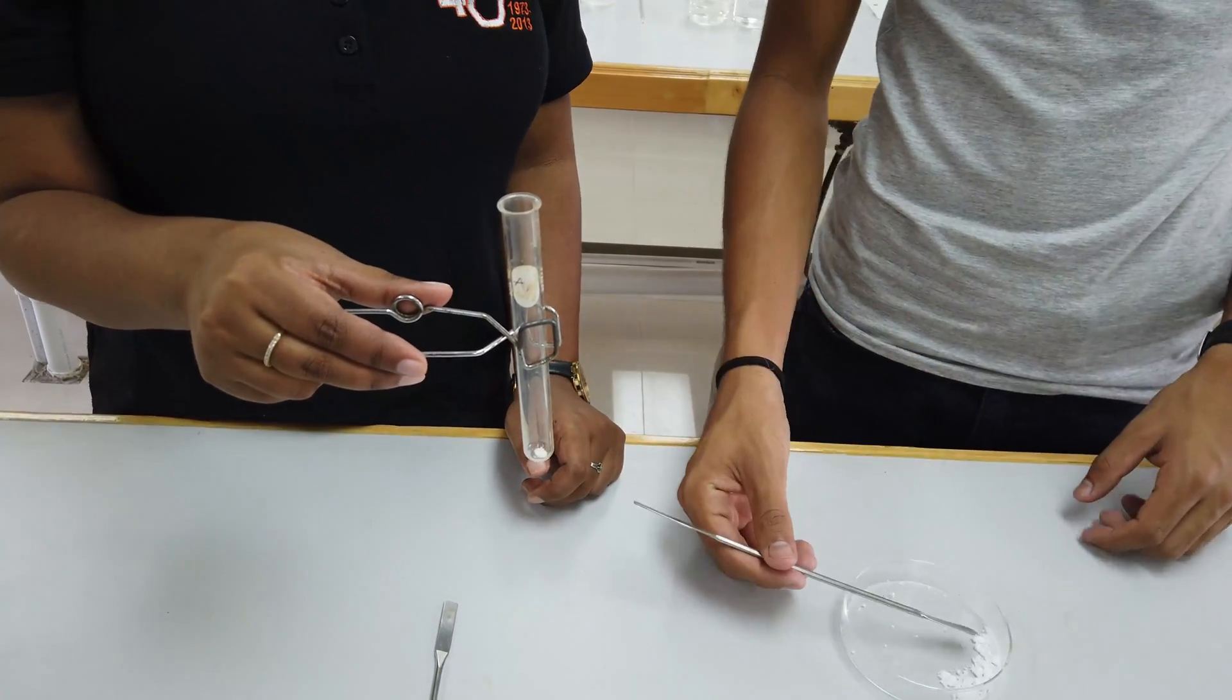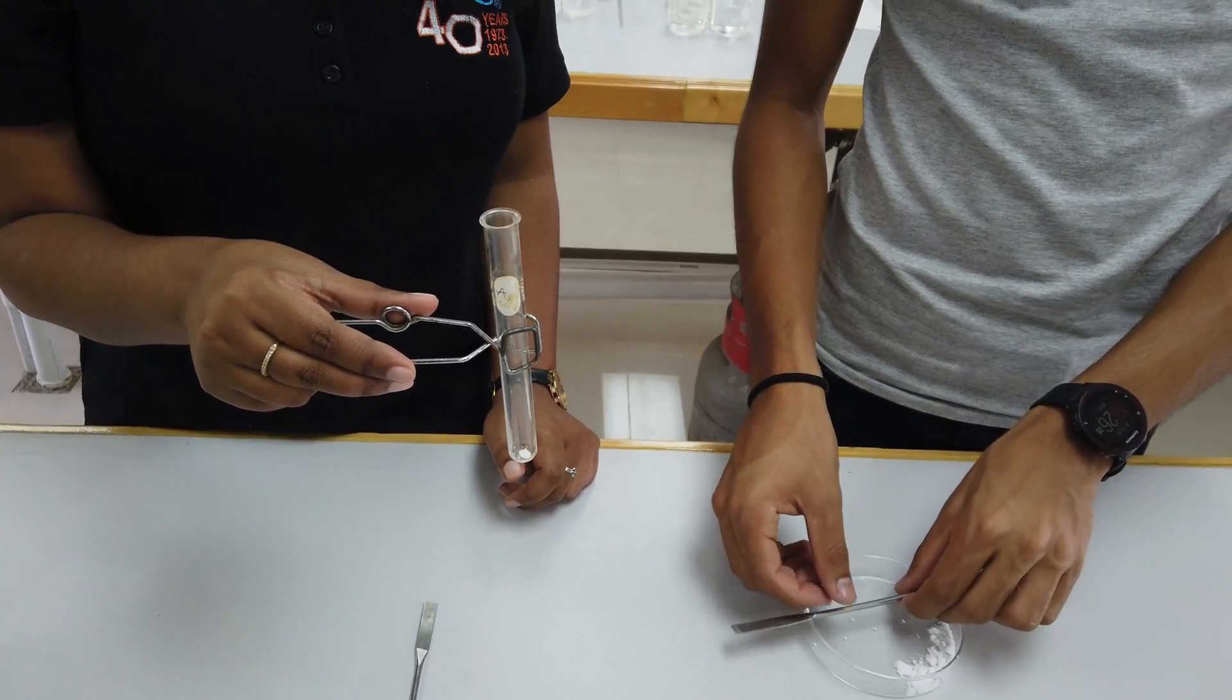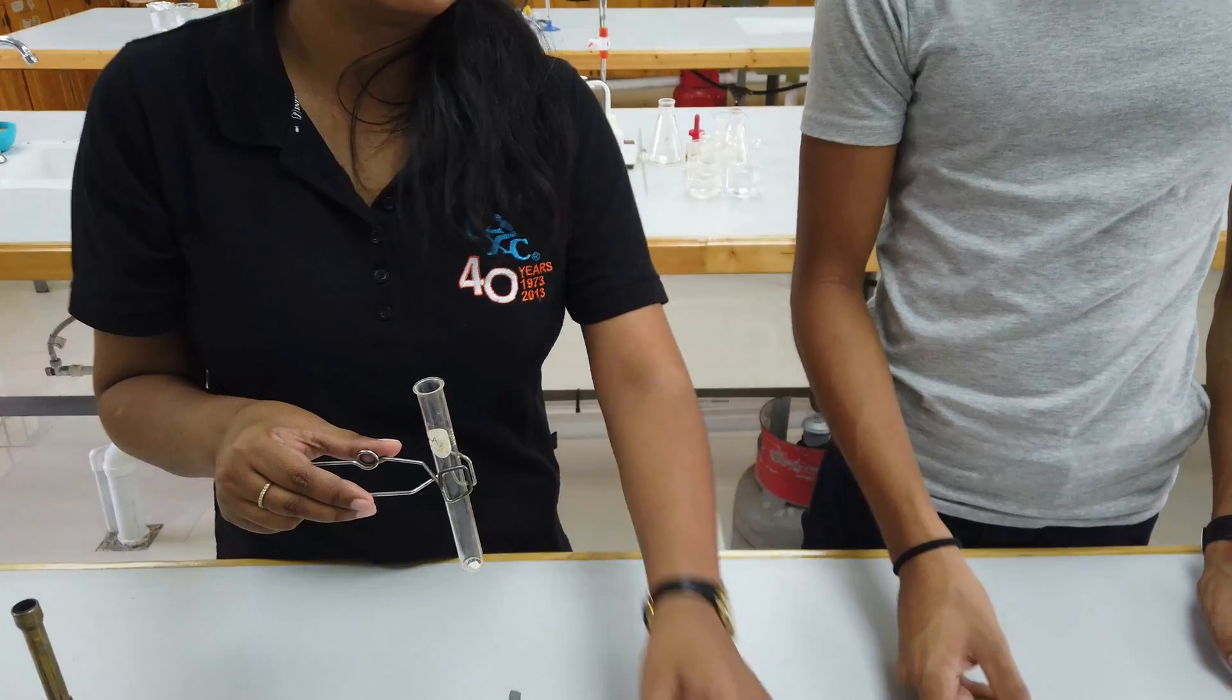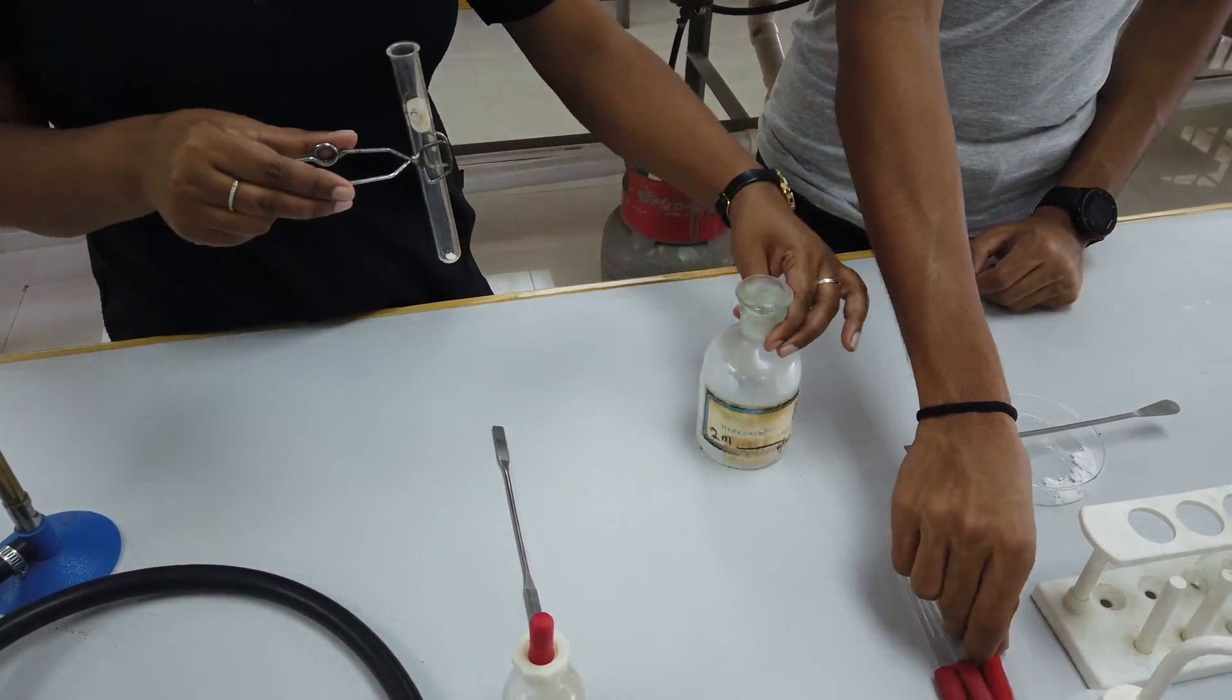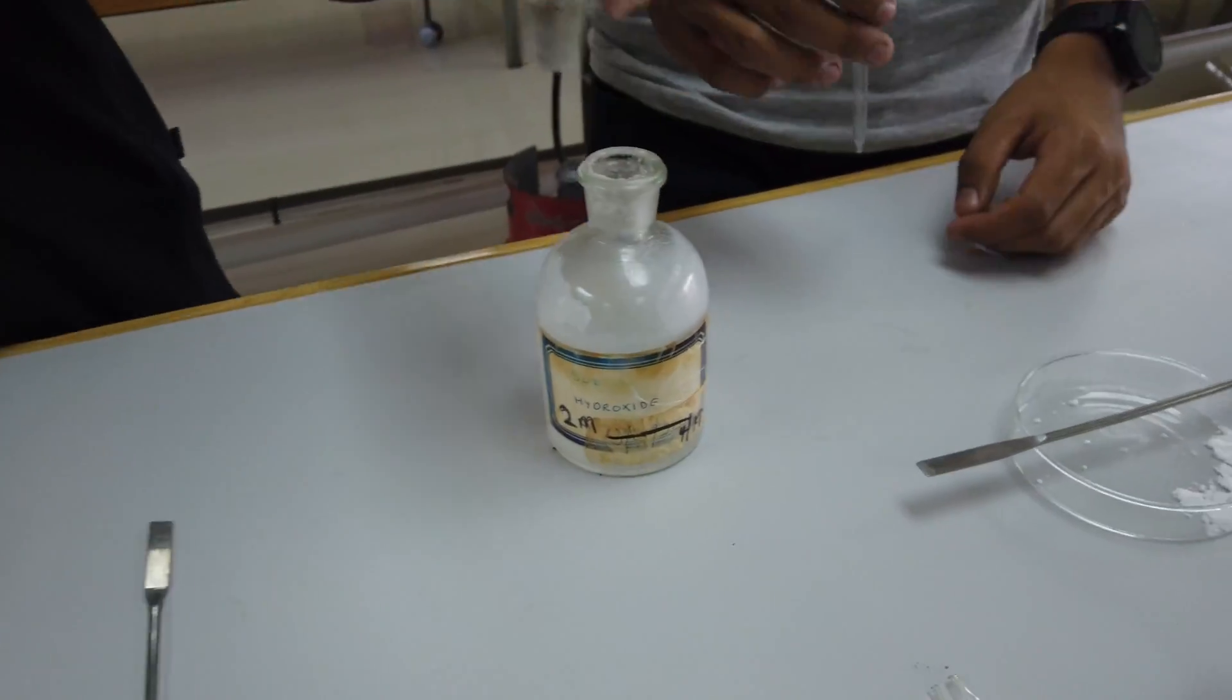Now we're going to add sodium hydroxide dropwise, and what we're looking for is a change in solubility and a change in color. Dropwise literally means one drop and shake it up, one drop and shake it.